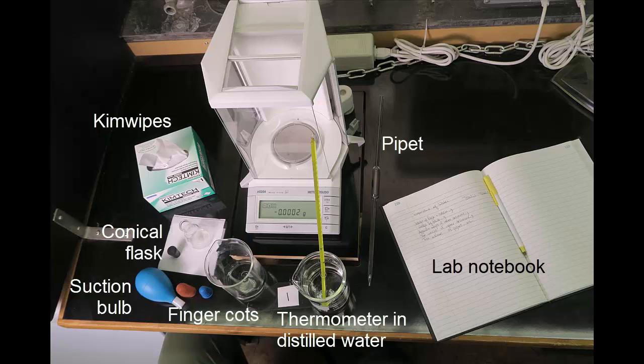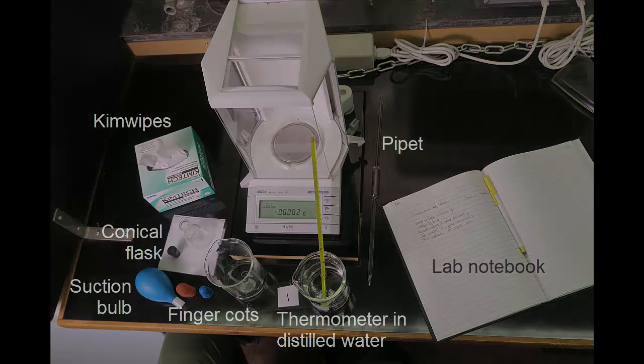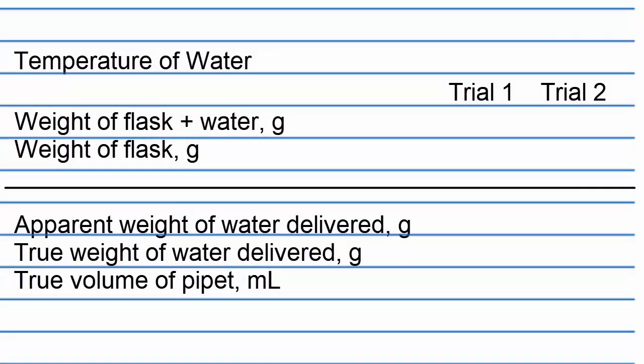You will require Kimwipes, a 50 milliliter conical flask and stopper, suction bulb, finger cots, thermometer, a 250 milliliter beaker containing distilled water, a waste beaker, a pipette, and a laboratory notebook. This exercise must be performed on an analytical balance. Your lab notebook should be set up like this.